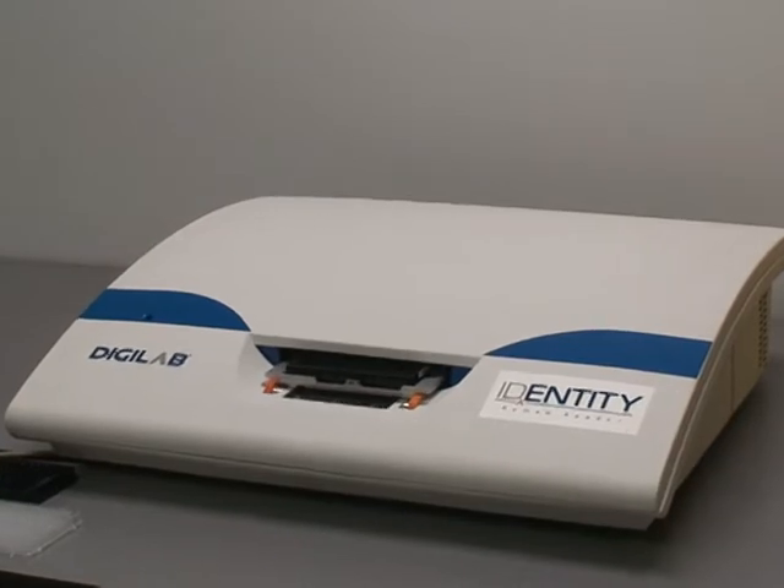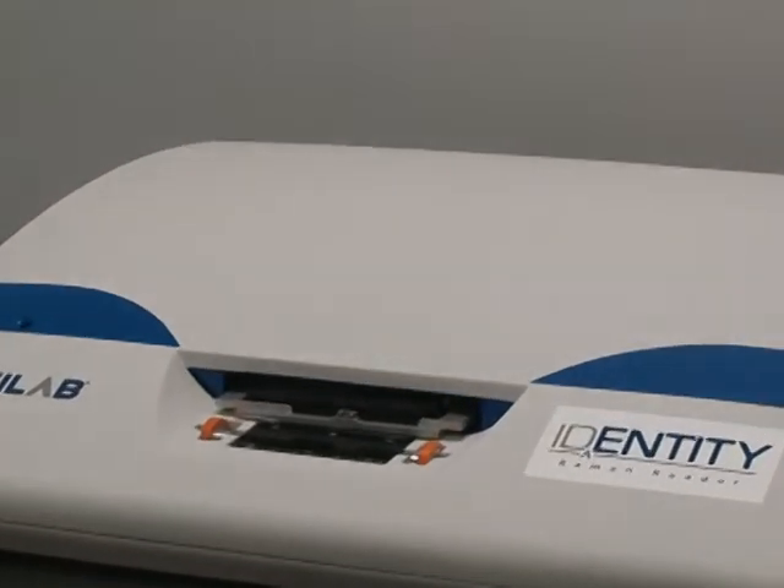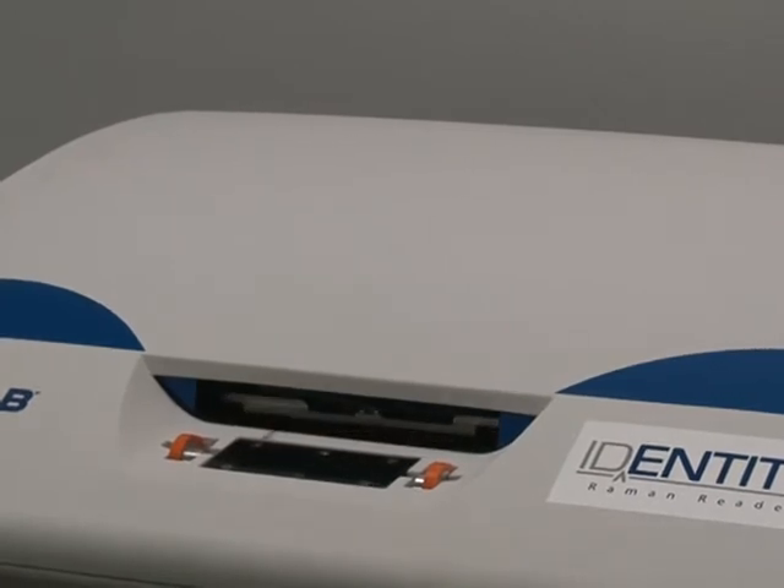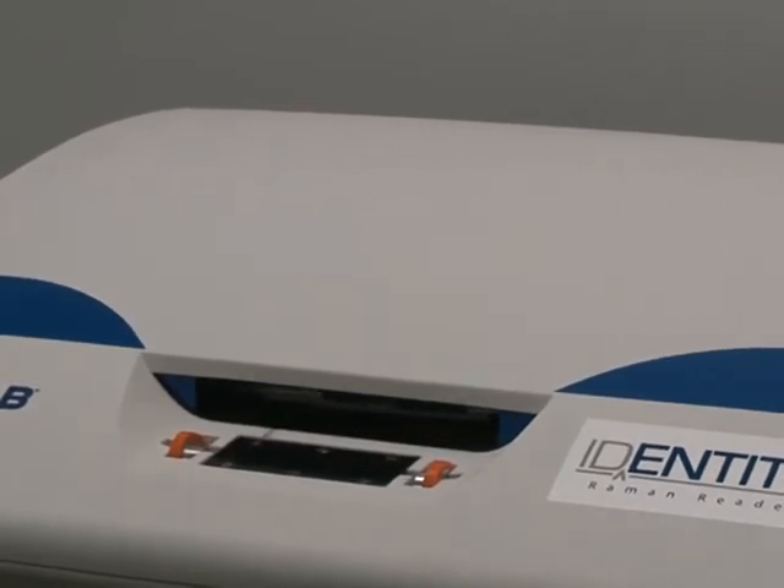It also works with glass slides, vials, and specialty labware, which DigiLab designs special adapters for. This reader was launched in early 2010.